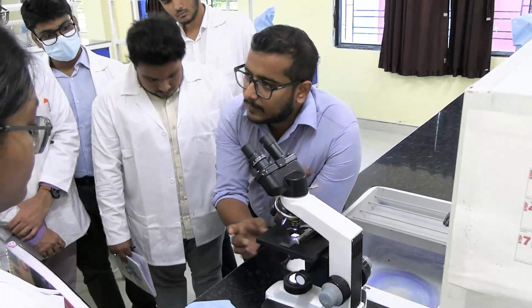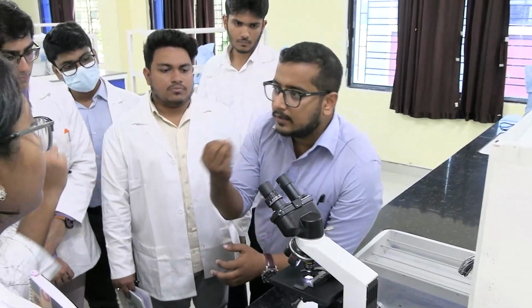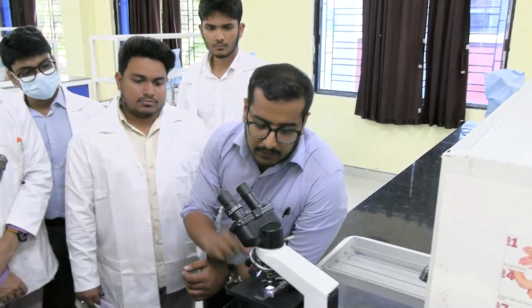This is the condenser. What is the function of the condenser? It focuses light on the object you are going to observe under the microscope.